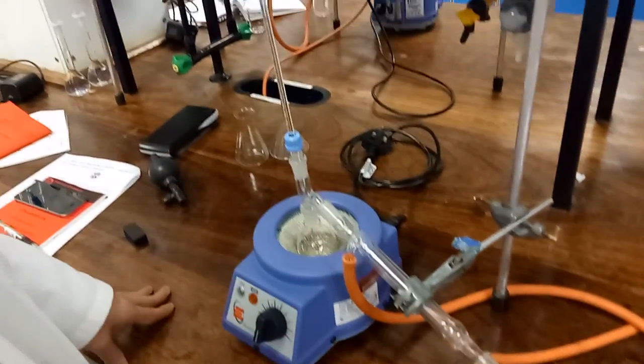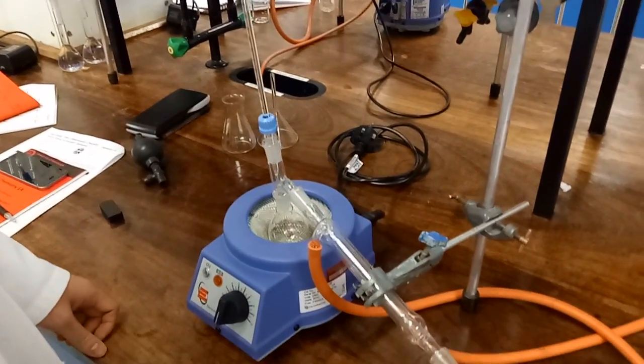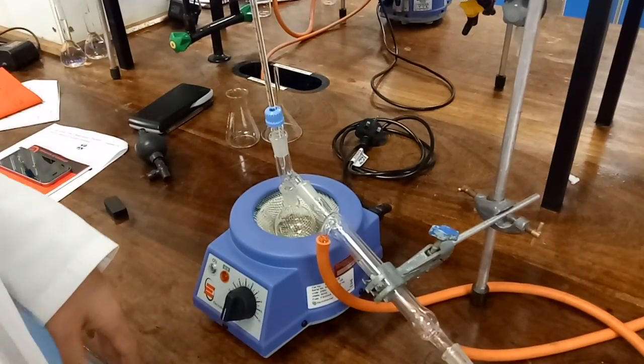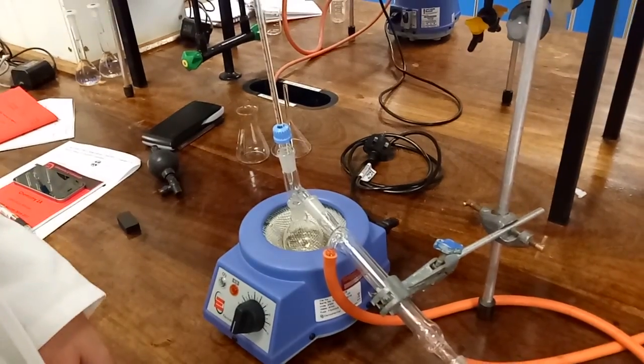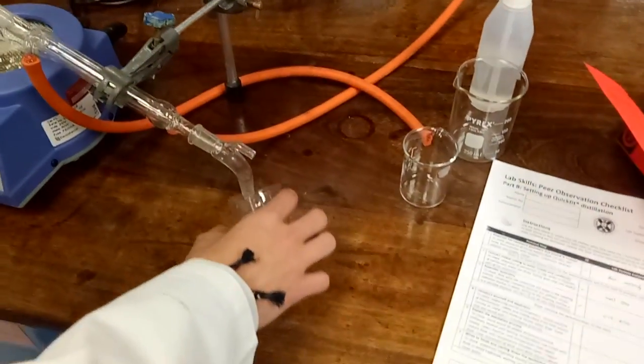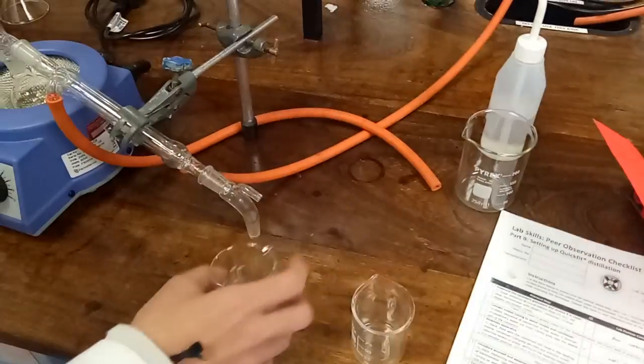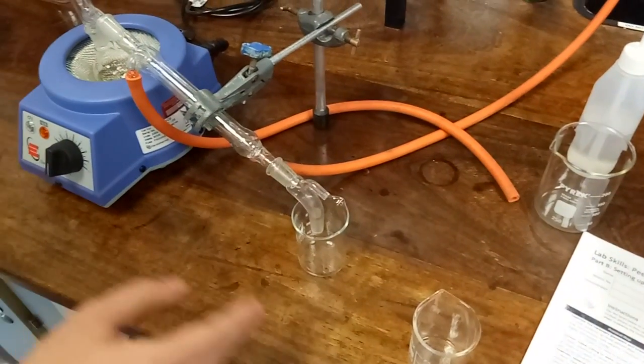When the temperature starts to rise again, that means it's gone past the first boiling point. We take this flask and replace it with a different one to collect the second fraction.